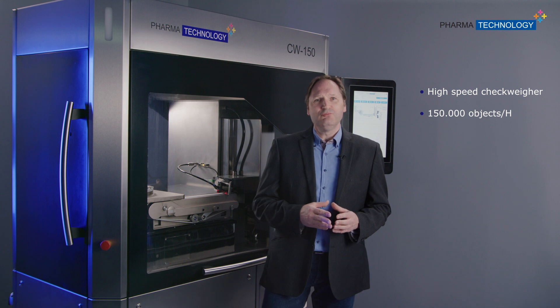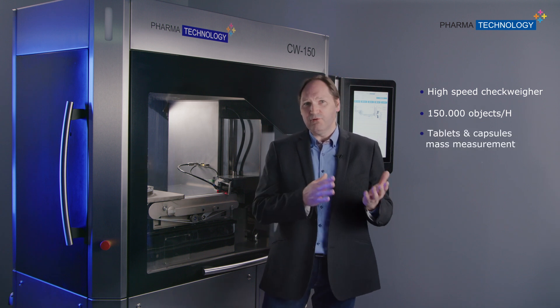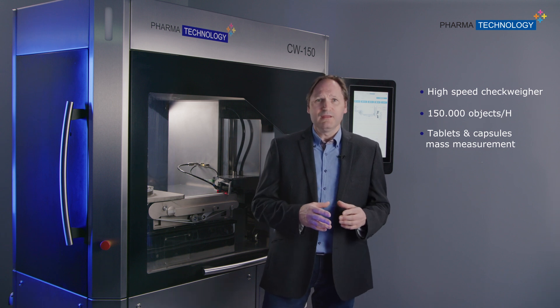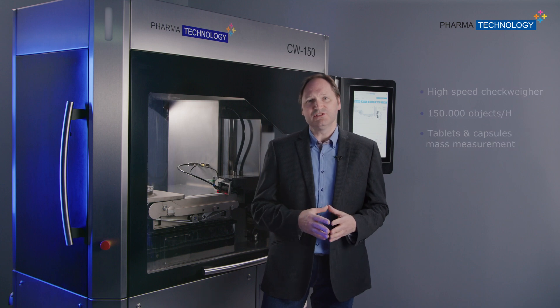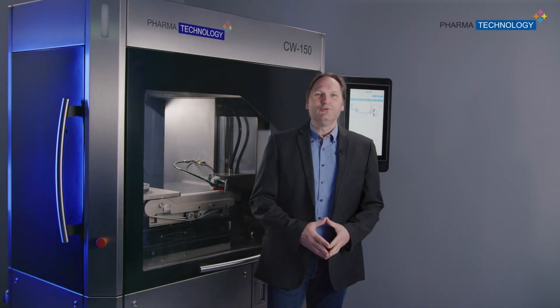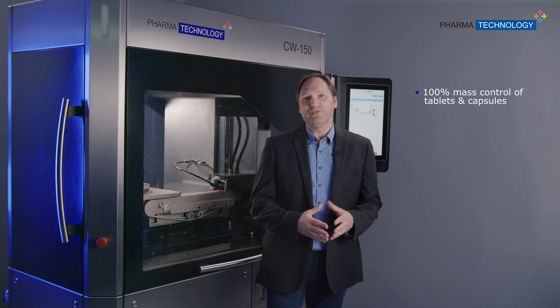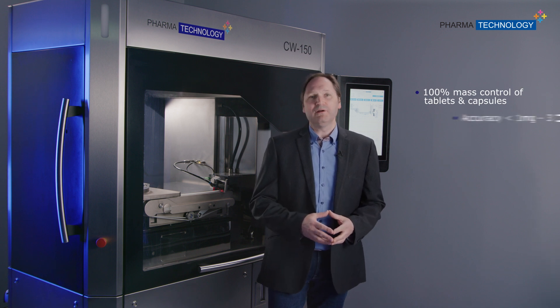The CW150 machine measures the mass of every single capsule or tablet in real time, and these measurements are done with 3D microwave resonance technology. The main key benefit of the CW150 is its ability to weigh both capsules and tablets on the same platform with an accuracy of one milligram.